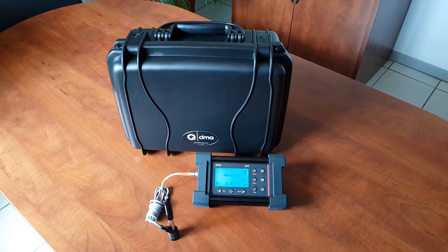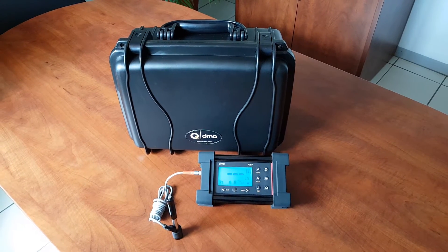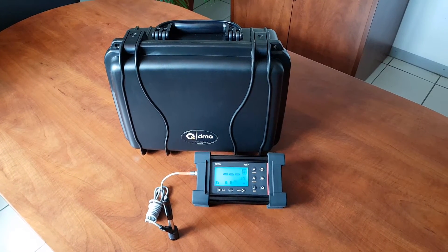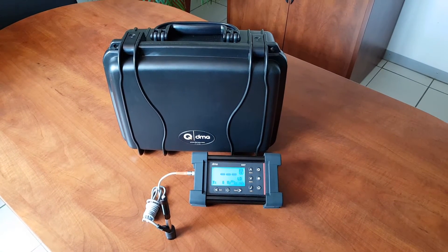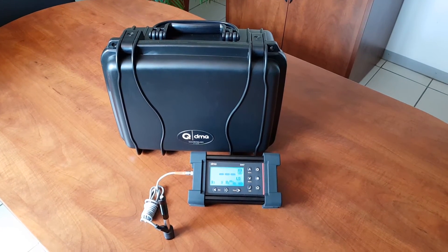Available also as the QH7U with a UCI probe for 10, 50, or 98 N test loads, or as the third model, the QH7C, which is a combo unit with both LEAP and UCI probes.